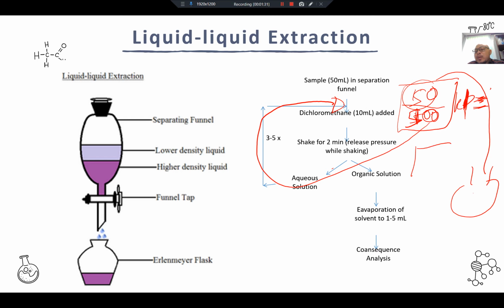In the next process, it will divide again into 2. Because you are left with only 50, you have here 25 molecules. You can take the supernatant over here and put it inside your collection flask. So right now you have 50 plus 25. Is that good? That is a very good extraction method. Or you can proceed further, here you say 3 to 5 times.